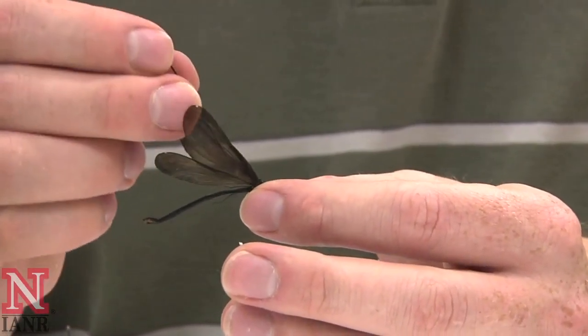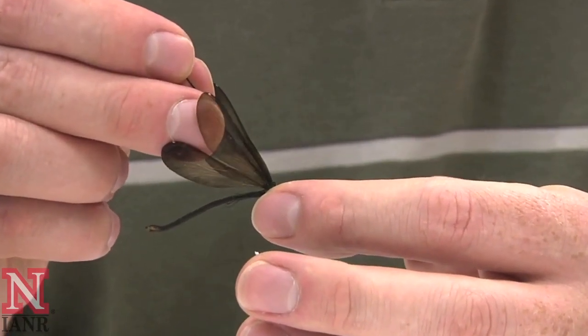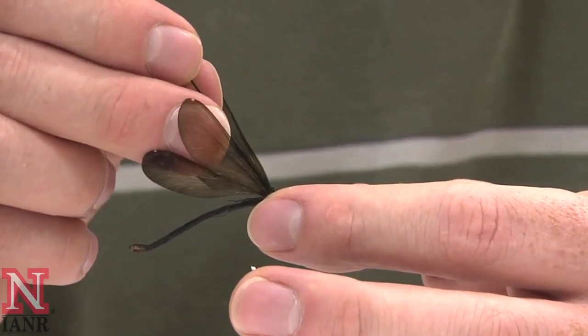To pin the damselfly, insert the pin in between the forewings at a perpendicular angle.